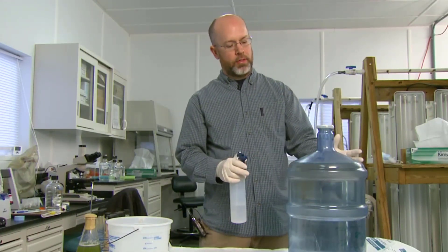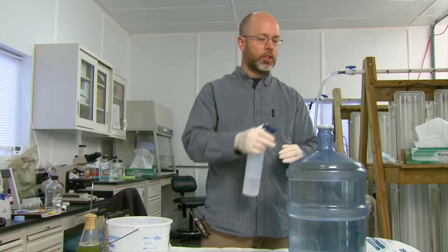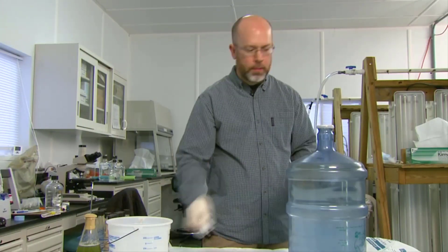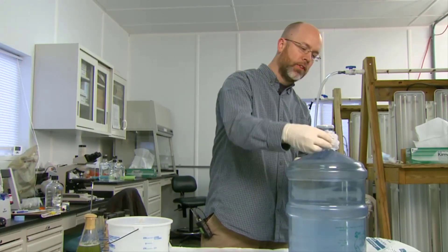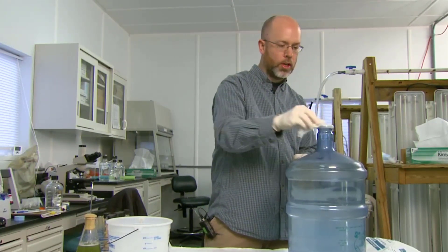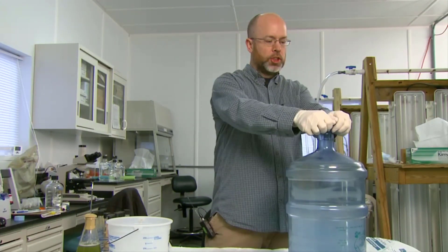Anything on the outside of the container obviously has potentially been contaminated, so I like to just spray a little bit of isopropanol on the cap and wipe that area down. Think of yourself as a doctor — you don't want any infection in your culture.